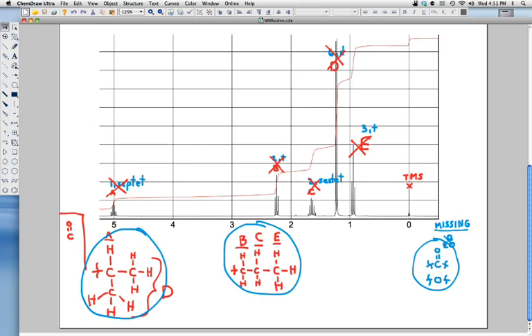And there's really 2 possibilities. Our isopropyl group could be connected to our oxygen, which is connected to our carbonyl and our propyl group, or the isopropyl group could be connected to the carbonyl and the oxygen and then the propyl group. The 2 carbon pieces here are terminal pieces. They only form 1 connection, so those have to form at the end. The pieces we derived here have 2 connections, so those have to be connected together. So let's do that. Let's cross that out and show that clearly we have an O connected to a C double bond O. And both of these are now connected to something else.